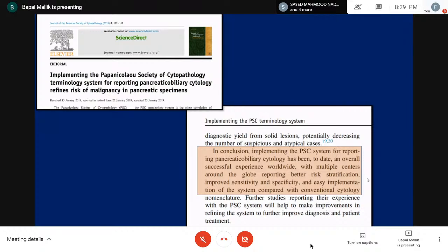Now, this particular system, of course, requires that for the full implementation you need to use fluid biochemistry whenever necessary. We need to use molecular cytopathology, and we have seen how these can enhance the sensitivity and the specificity. But there are situations where you may not have enough material, where you may not have the facilities. And what do you do under those circumstances?